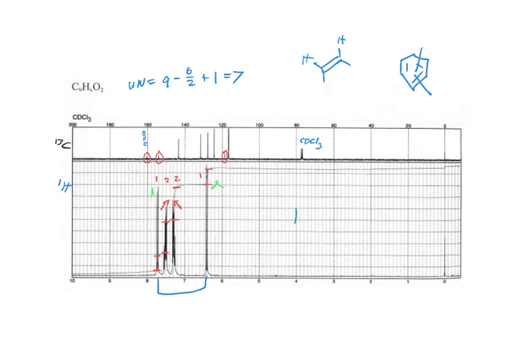Okay, so if we put our benzene here and we conjugate that to the ring, and we have a thing like this. So now how many unsaturations have we done? Oh, well, we've added one. That's 4 or 5, and we have a double bond in here somewhere, that's 6. How do we come up with the 7th one? Add another double bond? Well, do we have any signals for another double bond? No. Make a ring. Oh, yeah, so we have to make a ring.